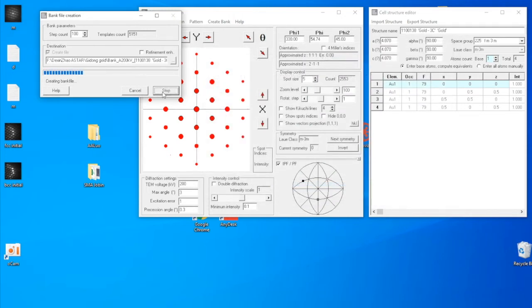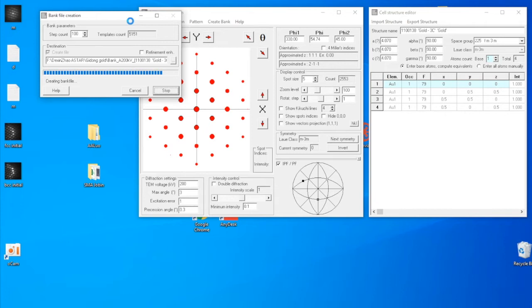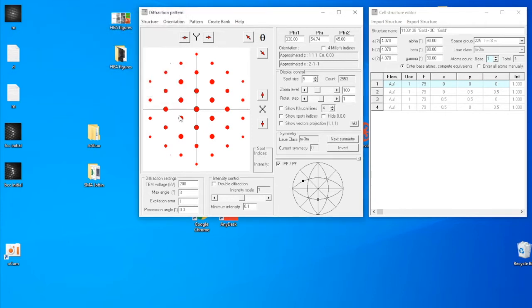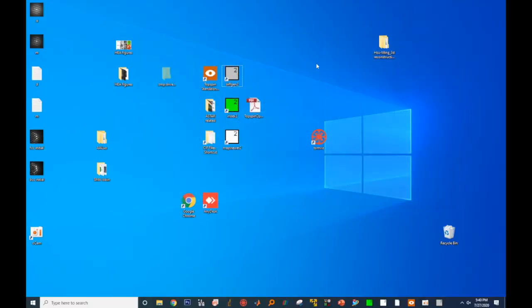This is real-time, so you can see it's very fast. Once it's done, close all the windows. You have successfully created a bank file which contains the simulated diffraction pattern of gold in your instrument.